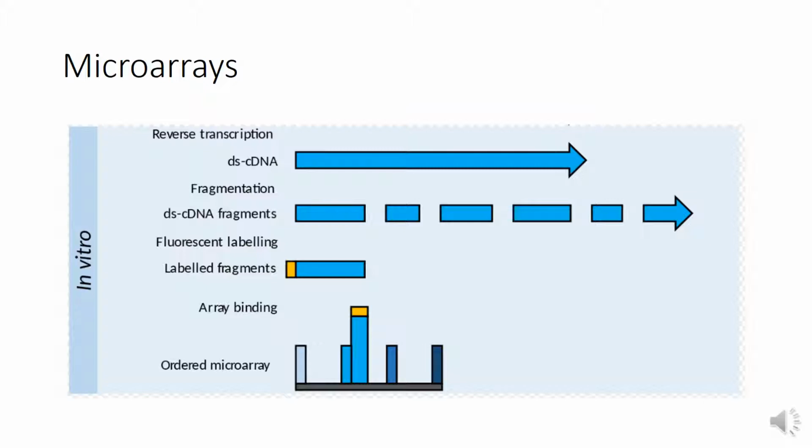This is done by adding a fluorescent tag to the reverse engineered strand. And once that fluorescent tag is on there, if it binds to the unknown DNA sample, then it can be imaged and you can determine what is bound in solution.